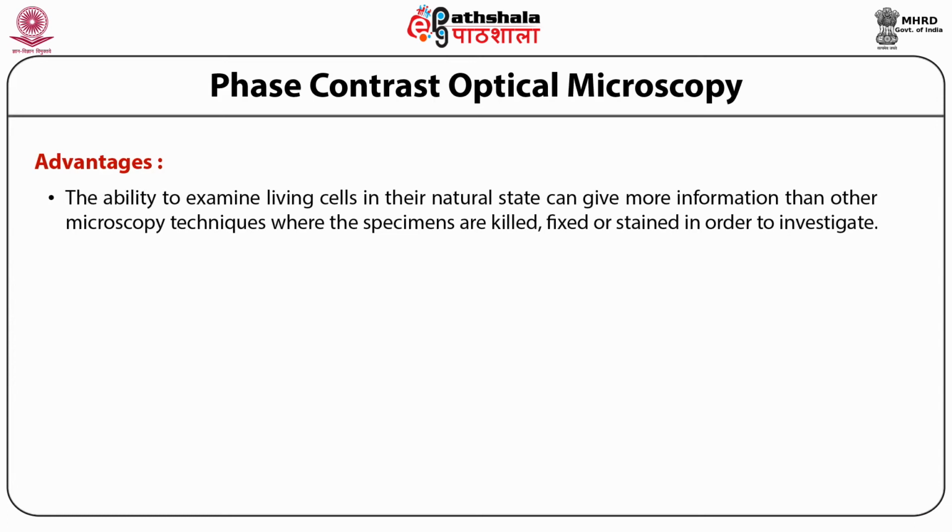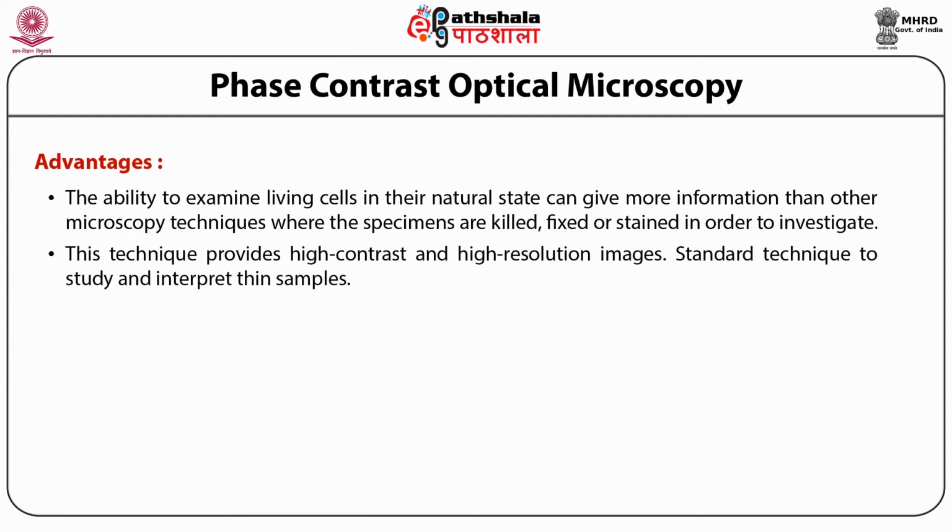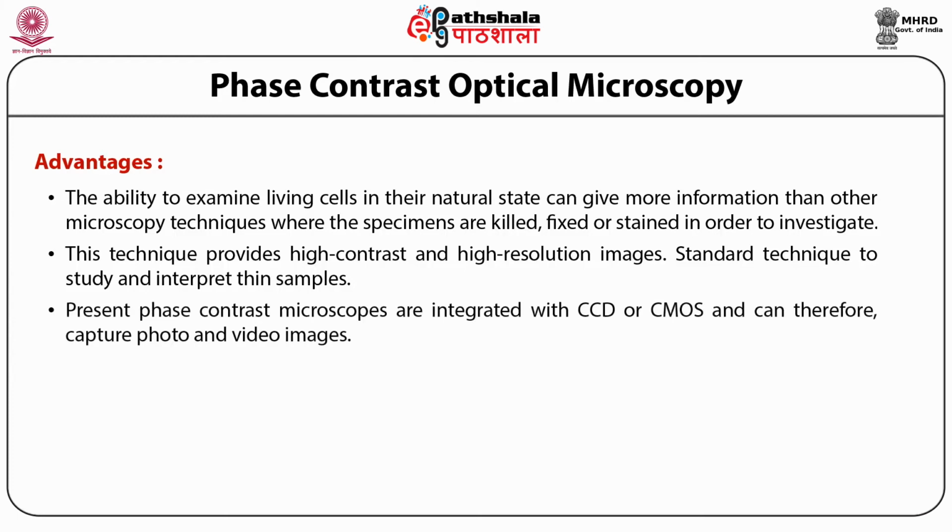Students, now let us see the advantages of the phase contrast microscopy. First, the ability to examine living cells in their natural state can give more information than other microscopy techniques where the specimens are killed, fixed, or stained in order to investigate. Second, this technique provides high contrast and high resolution images. Standard technique to study and interpret thin samples. The phase contrast microscopes are integrated with CCD or CMOS and can therefore capture photo and video images.